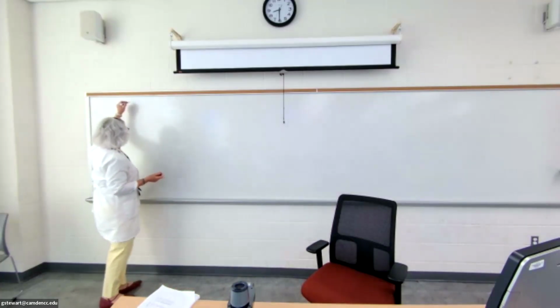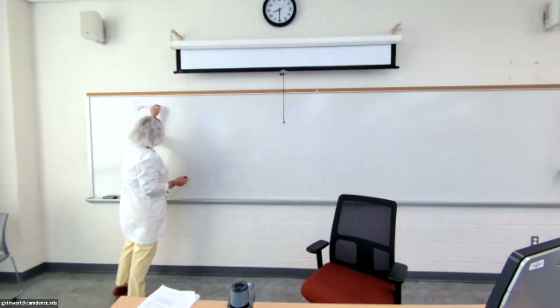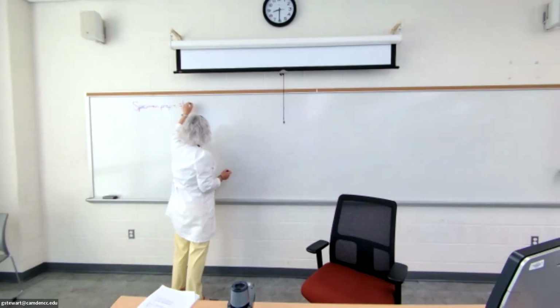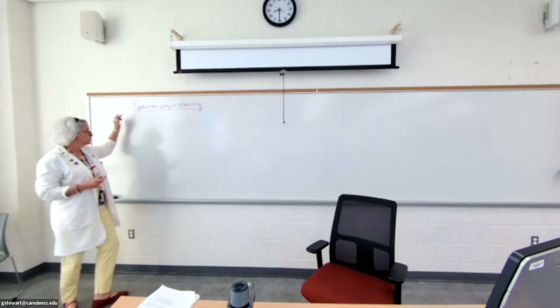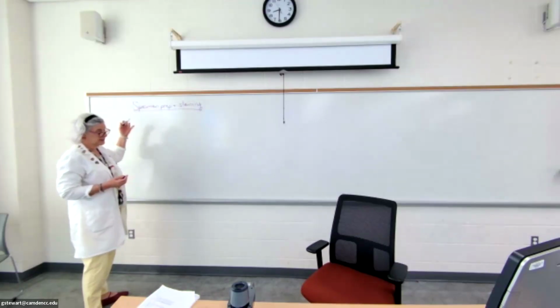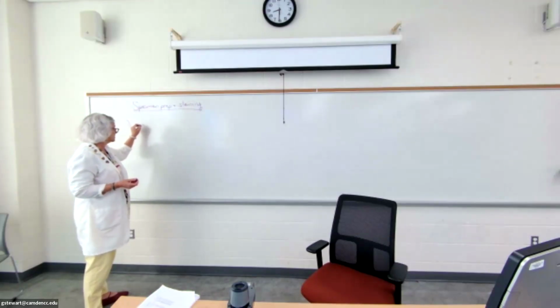Okay, so this section is going to be specimen prep and staining. And this is, like I said, kind of the last section of chapter 3. So the specimen prep you already know a little bit about because, like I said, we've already done it. The first step of that is to make a smear.